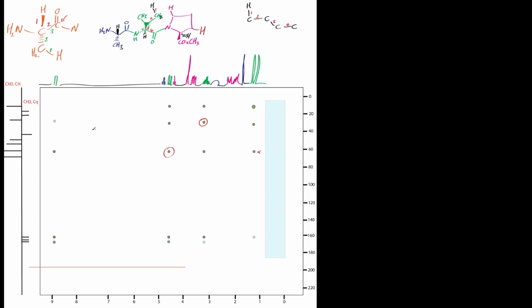So let me just get rid of those circles. Let's have a look at the isopropyl proton. Well, the isopropyl proton, as we know, comes at this signal, and if we did that low pass J filter, we'll be able to see that as a doublet. We know it's connected to this CH3, there's 2 CH3s there, so we'll see the signal there. If we look, we also see the alpha proton as expected, because that's only a 2 bond correlation now. Remember, the hydrogen's coming up there like that, so we've got 1 bond for the hydrogen to carbon, and then another bond from the carbon to the carbon, which is the alpha carbon. So there's a 2 bond correlation there.